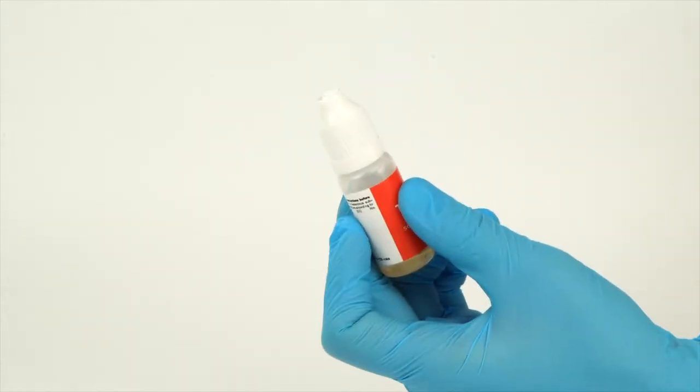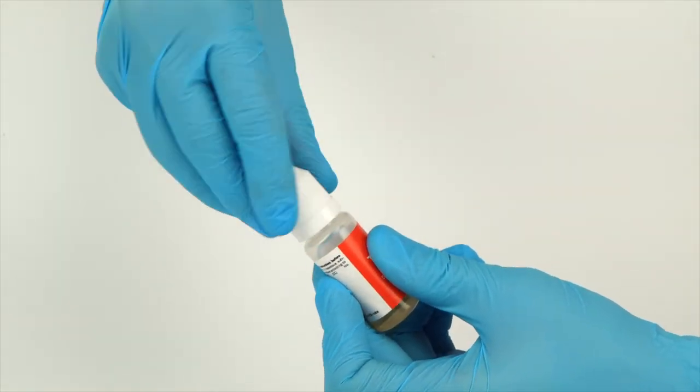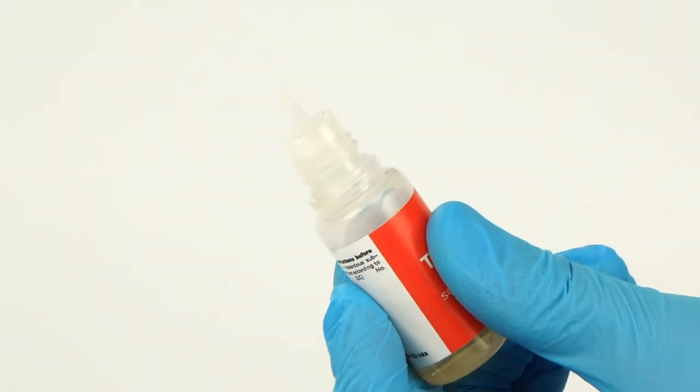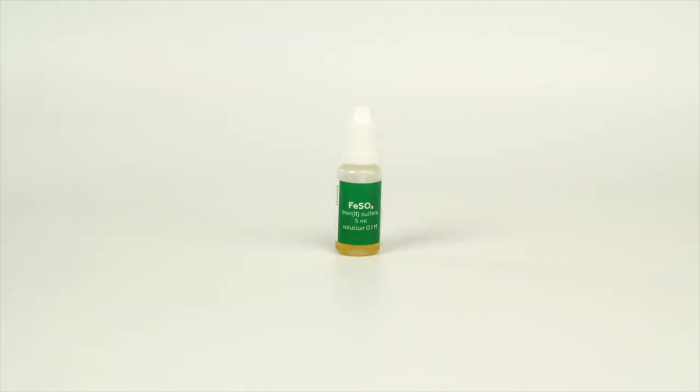To open a bottle containing a reagent, push the cap down and turn it. Carefully pierce the bottle nozzle using an unbent paper clip.